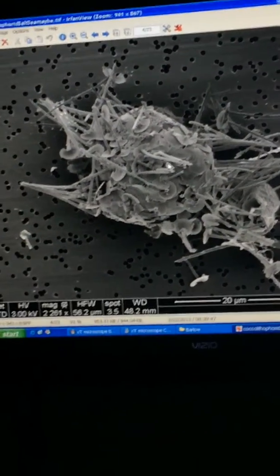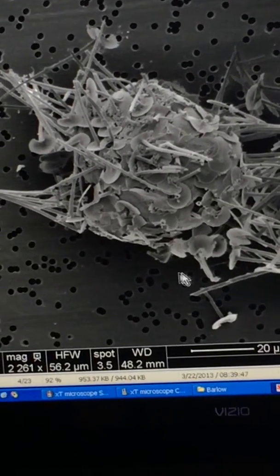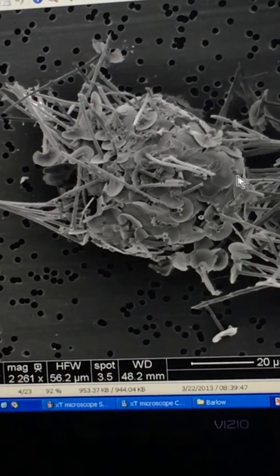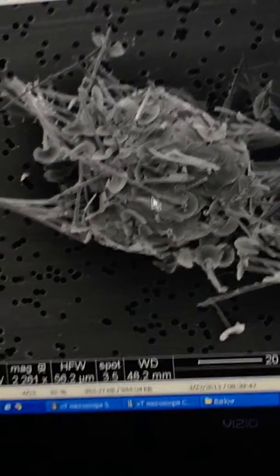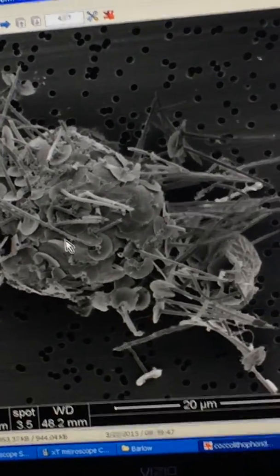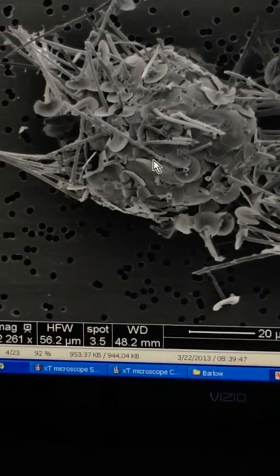Let's see, what are some different pictures I might have available? So these are probably coccolithophorid scales. And these were ones created inside. This is that poor cell. So these were secreted to the outside. These are made of calcium carbonate. And the ones that we're looking at in this other organism are silica. In the green cells, in the green plants, their scales are organic. But they're all, again, being produced inside these vesicles and secreted.